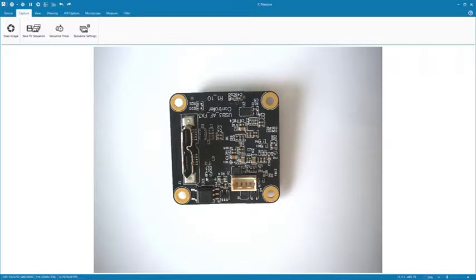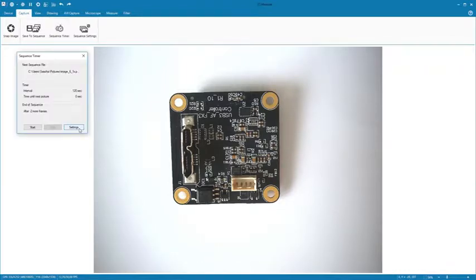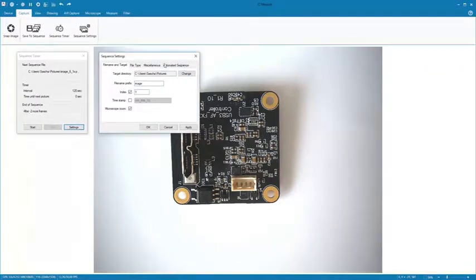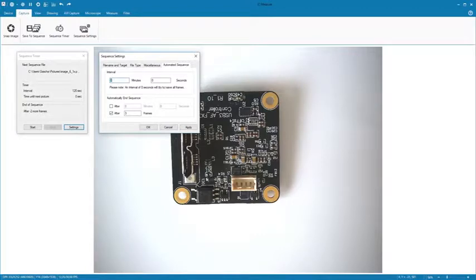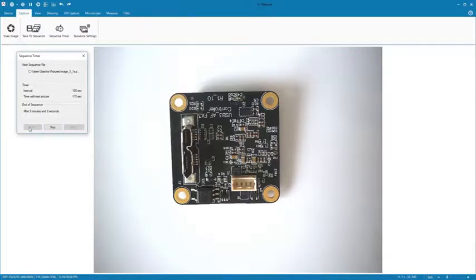Under Sequence Timer, image sequences can be triggered via a timer. For example, one image per second over a 24-hour period.